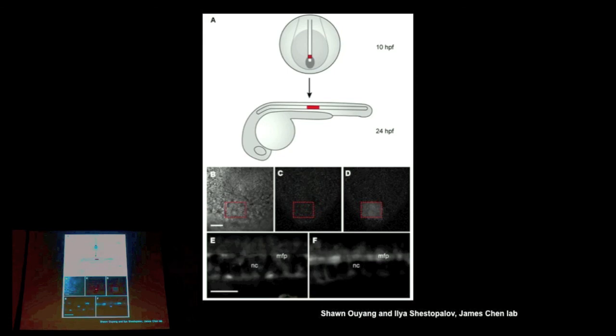So this was a no-tail morpholino. Before photoactivation, nothing's there. And after photoactivation, so they put in a photoactivatable protein along with the caged morpholino, so you could see where the photoactivation took place. And they were able to cause the notochord cells to become medial floor plate cells instead of differentiating to notochord. Okay, so spatially restricted photoactivation, or spatially restricted uncaging. Great. Any other questions for Andrew?